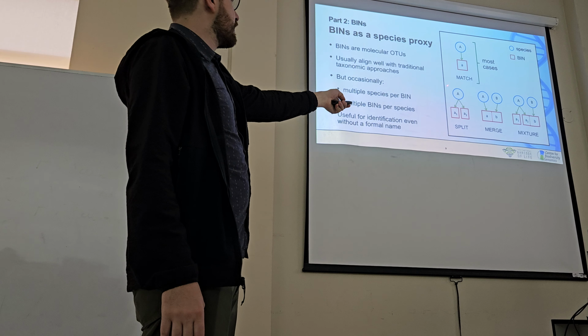So sequencing centers. You can see most of the sequences for this institution were actually done at the Center for Biodiversity Genomics in Guelph, where we work. So probably samples were collected and shipped up to us, we sequence, and then we either keep them there or send them back.